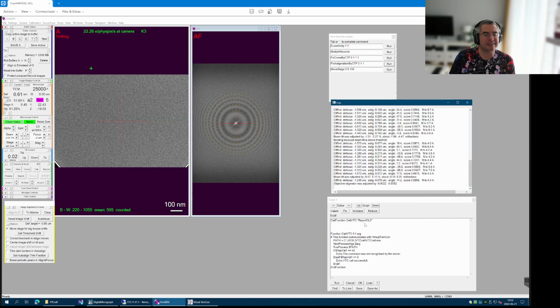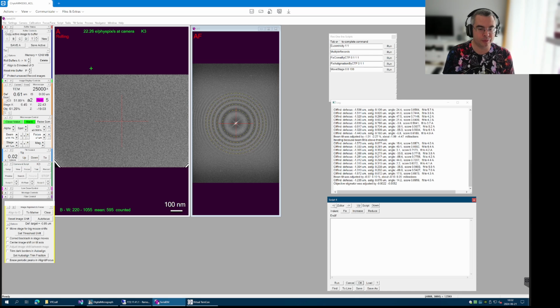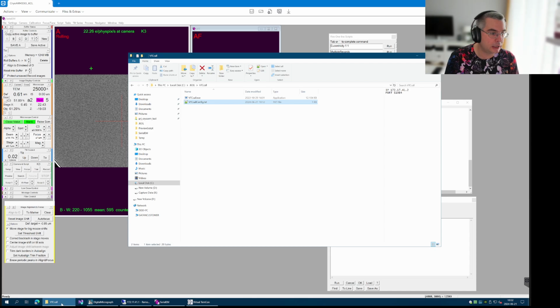Now, let me show you an example of how to use VTC. Well, similarly to Python, to the previous original JAFIS, we can use run in shell, and this will work. So we can say run in shell, then we can say C JEOL VTC call exe.